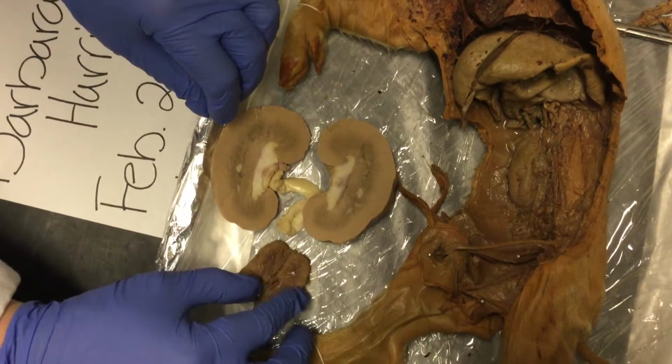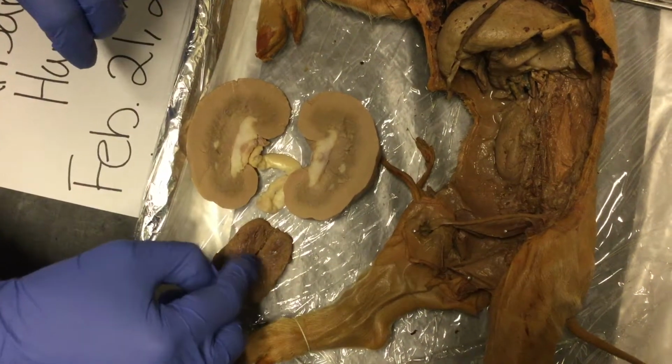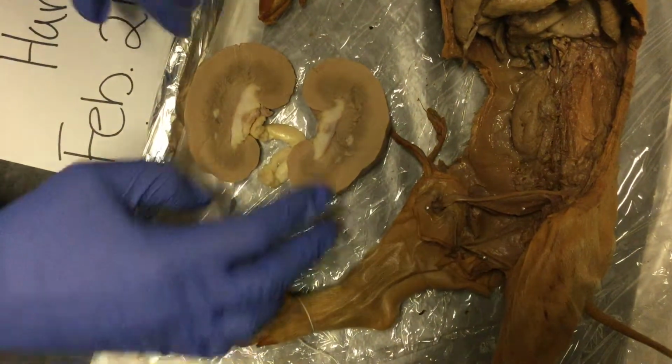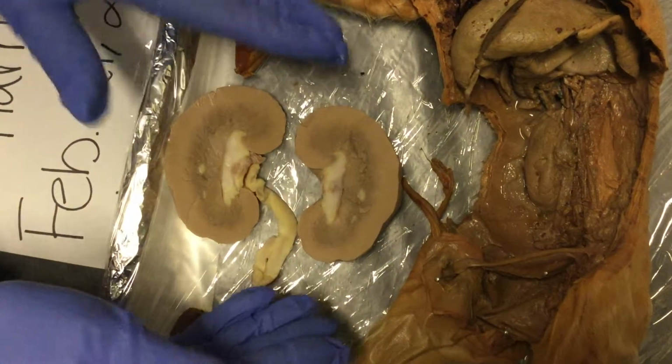The renal medulla is this inner portion right here, and the renal cortex is on the outside right here. Like I said, here is our sheep one, which is a lot easier to observe.